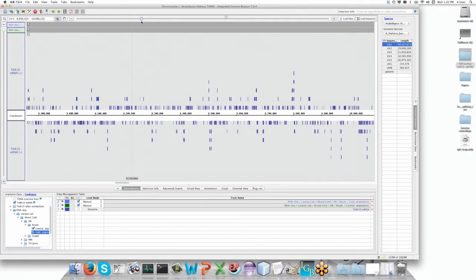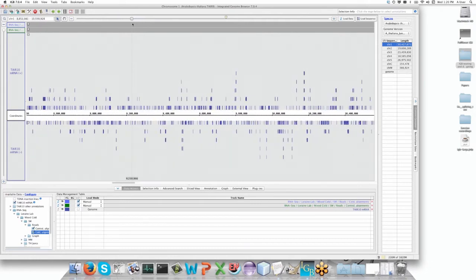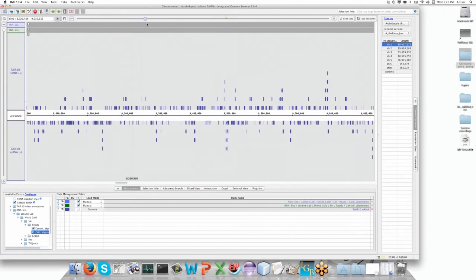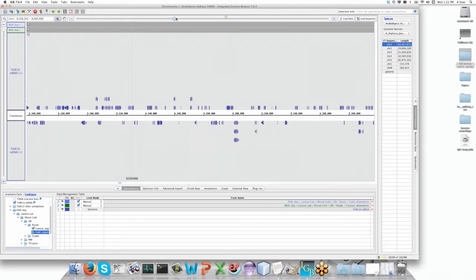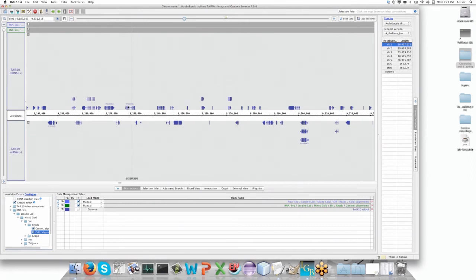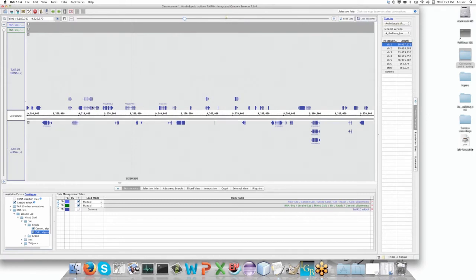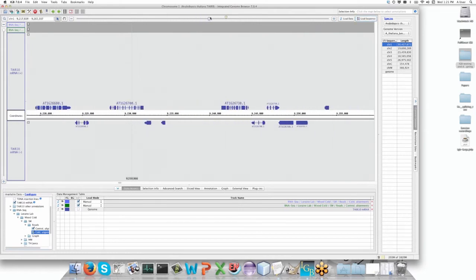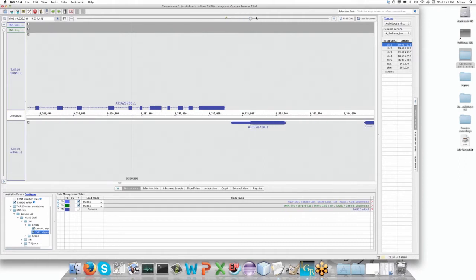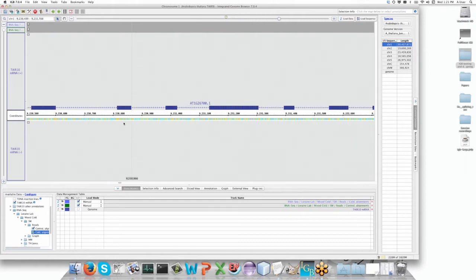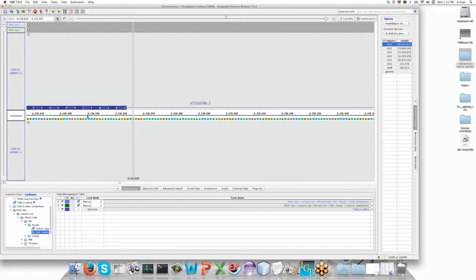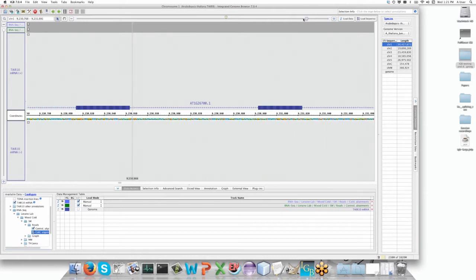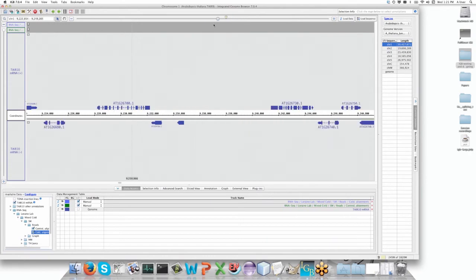A very interesting feature of IGBI is called semantic zooming. You can notice that as we start to zoom in, these single hash marks begin to display the elements of gene models, introns and exons. As we zoom in more and more, we begin to pick up the details of gene names for instance. If I have the sequence already loaded, you can see it as this gray bar. As we zoom in further and further, first of all you can see where transcription begins and where translation begins. Even further, we start to see the sequence. Each nucleotide is color coded and we begin to see the codon layout. If we zoom in far enough, we begin to see the actual nucleotides and amino acid designations along this model. The zooming flows when you use this zoom bar.